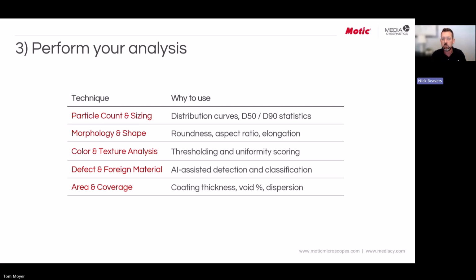And a lot of the times what it starts with is either one of two things: either a manual measurement that's going to be obviously more time consuming. You see that in a lot of software. But what we're going to demonstrate today is a time savings where you have an efficiency that you can apply repeatably, that can be across users, and will be more consistent regardless of who's using it. And that's a concept called segmentation. And segmentation is something that we're probably going to really dig into a lot today and talk about how that can be integrated into protocols to make this a lot easier for you.